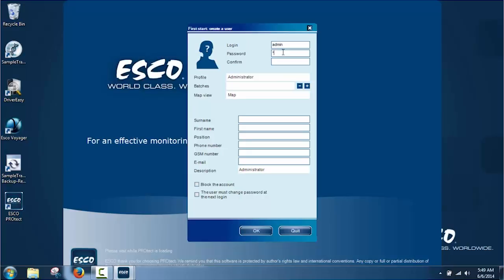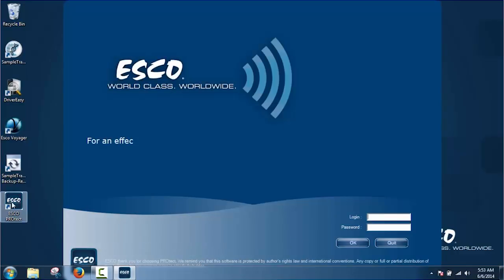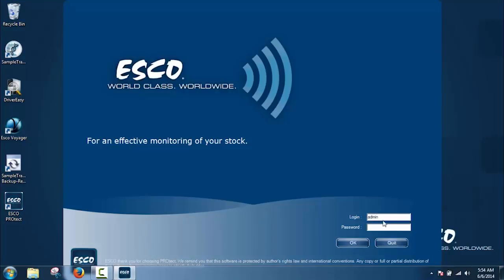Please take note that when operating the ProTech for the first time, the user should create a login administrator. If this login is used for the configuration of ProTech, the user should not delete it later, because all the remote alarms and planned tasks created by this login will be deleted as well.